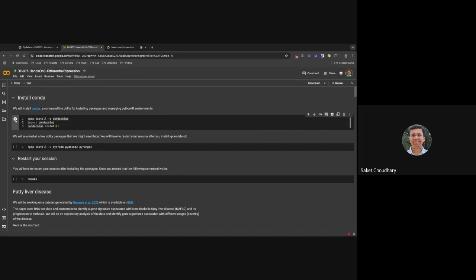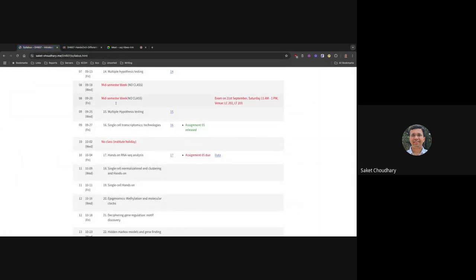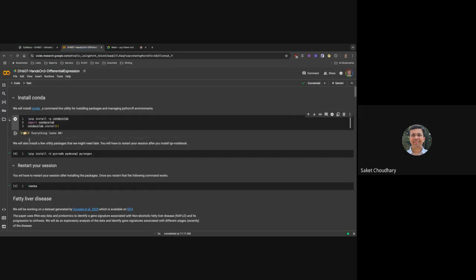We'll start by installing Conda because it makes the task of installing other tools very easy. Is everyone able to find the link to the notebook? You go to the syllabus page, navigate to the 17th lecture, click on this link. This will take you to this notebook. And we'll install Conda.